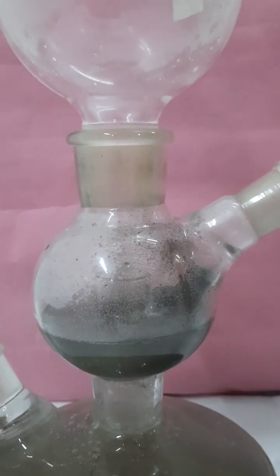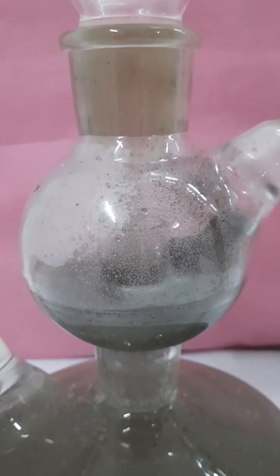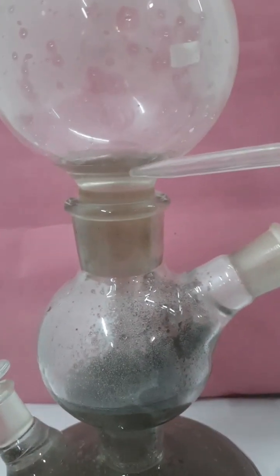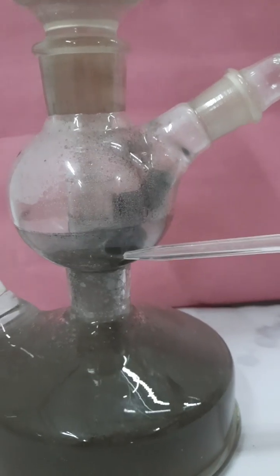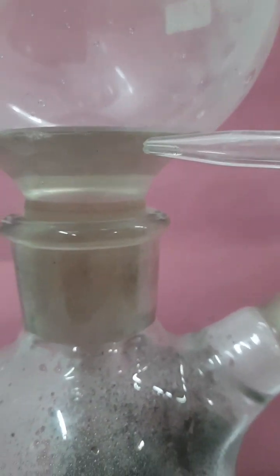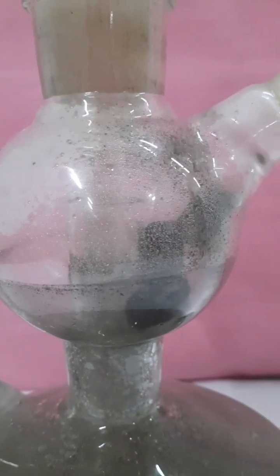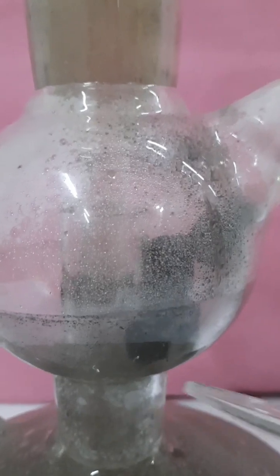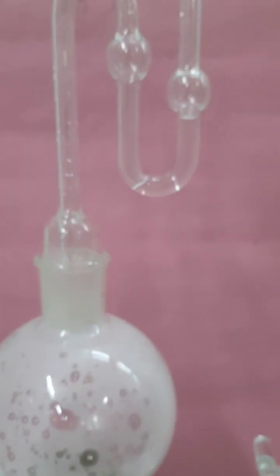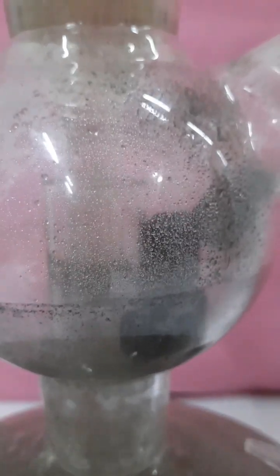When the gas is released again, the dilute sulfuric acid falls back into the third chamber and rises into the second chamber, and the reaction starts again. In this way we can control the preparation of H₂S gas. The gas in the middle chamber pushes all the dilute sulfuric acid into the lower chamber, which rises into the upper chamber through the long tube. In this way we can easily prepare H₂S gas in the laboratory, which is used during salt analysis.